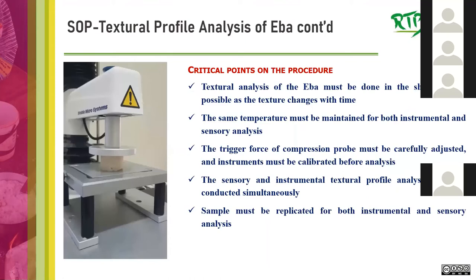Now, the critical points for this procedure are, number one, the EBA must be done in the shortest time possible as the texture changes with time. And that is what we dictated in the procedure itself, so we need to put emphasis on it. When we say 60 seconds, it has to be 60 seconds.